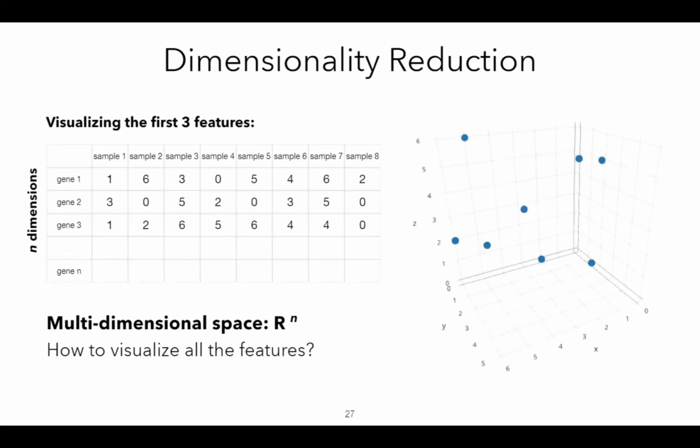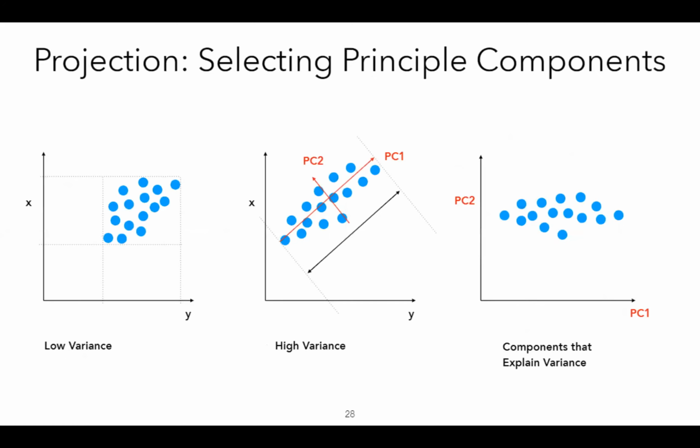But if you have more than two genes, let's say in this particular example you have three genes, then this becomes a 3D picture. Or if you have 10,000 genes, that means it's 10,000 dimensions. So PCA is a dimensional reduction technique, so whatever number of genes you have, you could convert them and plot them onto a 2D graph, so that you could visualize the data, visualize the samples, where exactly the samples lie and how it looks. So PCA is nothing but a dimensional reduction technique in order to visualize all your data.